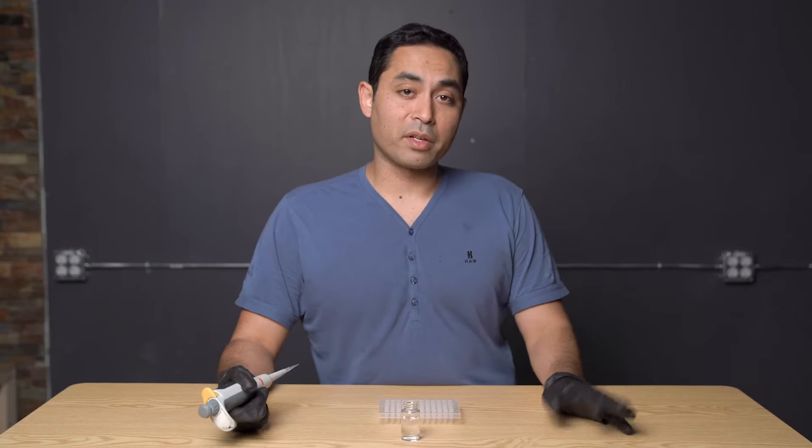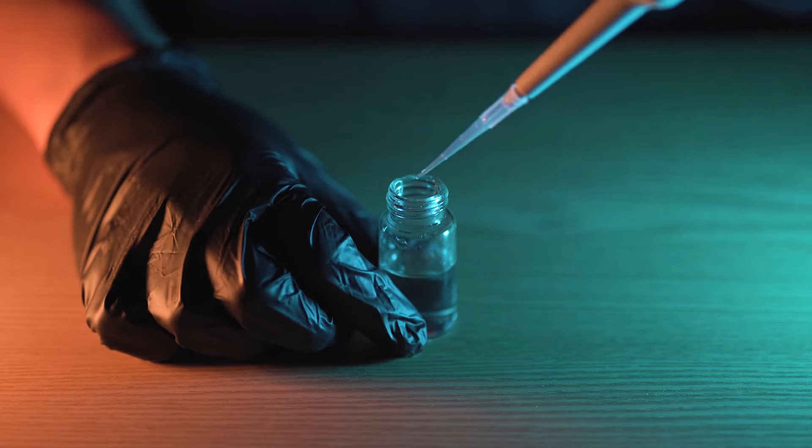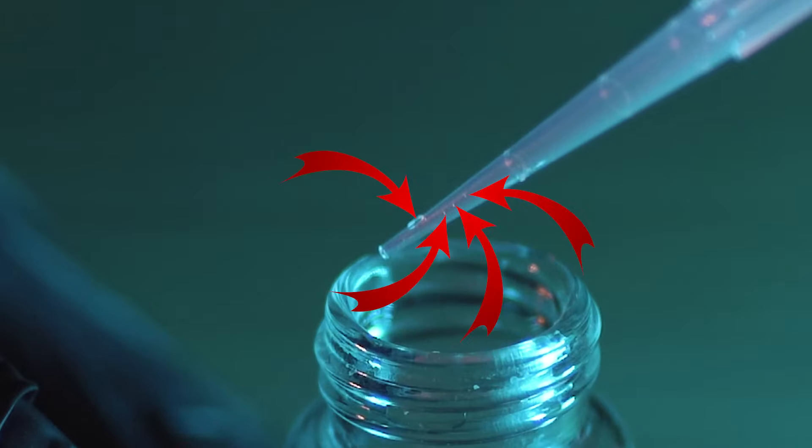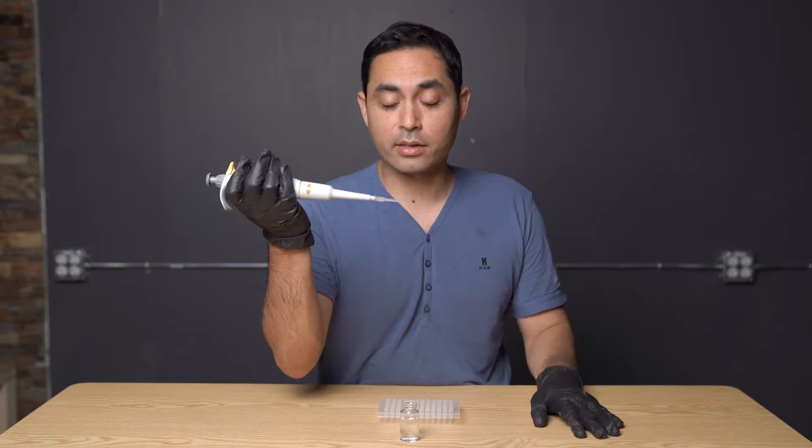The fourth thing is to examine for any droplets. When you do a quick dispense, you can see there are some droplets remaining. If you're dispensing too quickly, you'll have residual volume left in the tip, which takes away from the volume you should have dispensed. Watch out for droplets.